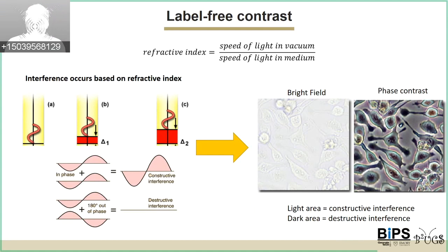So this very simple label-free approach is very useful. However, it doesn't give you molecular specificity. It tells you about the morphology, but not necessarily the chemical makeup. There are also label-free techniques to do this, and Nish or Paloma in the Robles lab could tell you more about them, but a highly popular approach to the problem of molecular specificity is to use fluorescence.